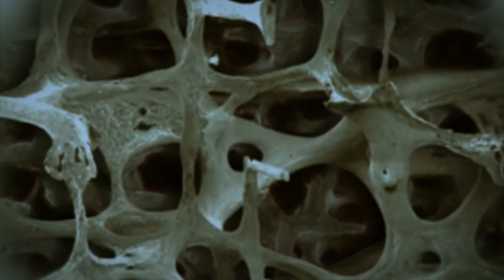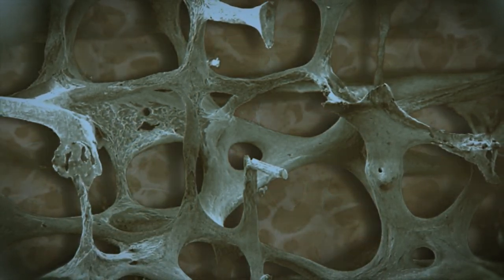At the moment, a lot of people doing bioprinting do it like 3D printing — they just squirt gel in a dry environment. But we are water-based; we are 75% water, so all our organs have to be in a wet environment. So we're doing a fluid phase system — we print in a fluid phase, keeping the organs or at least the micro tissue in its physiological state at every step of the printing.